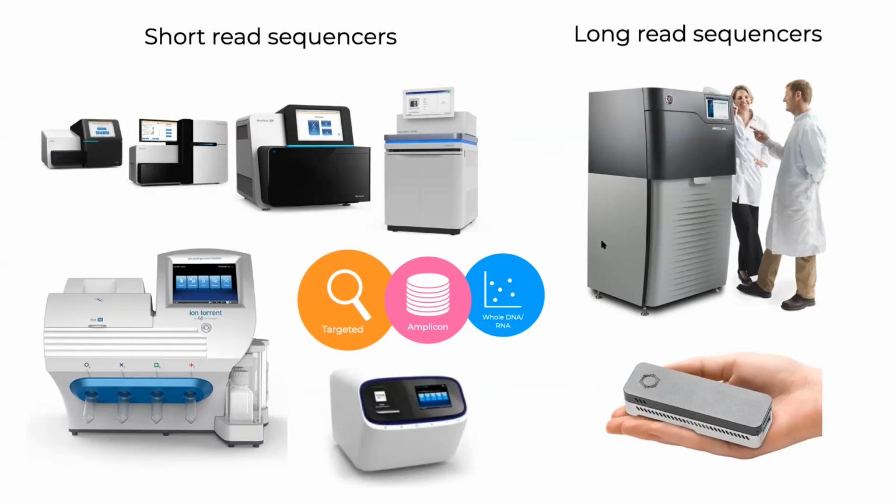And so a lot of times we're also seeing an integration between different methods, right? One application of the same genomic material could be done with a PacBio or an Oxford Nanopore to provide us with the length. Some of it could be amplified using Illumina sequencing, and that provides us with coverage. The important part here is that we are also limited by the amount of biological material, because every time you do sequencing, that material is spent. So a big part of the sequencing process is PCR amplification.